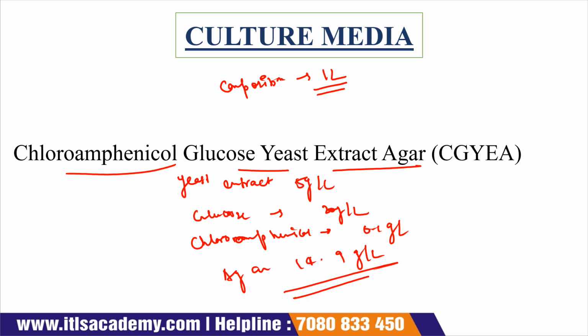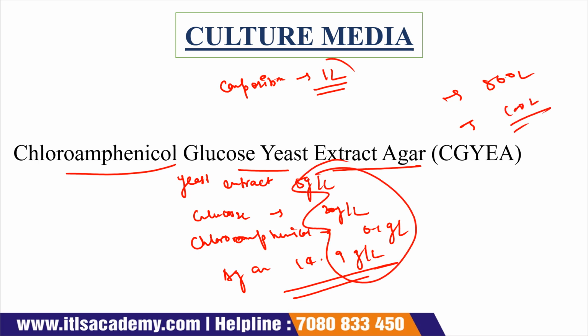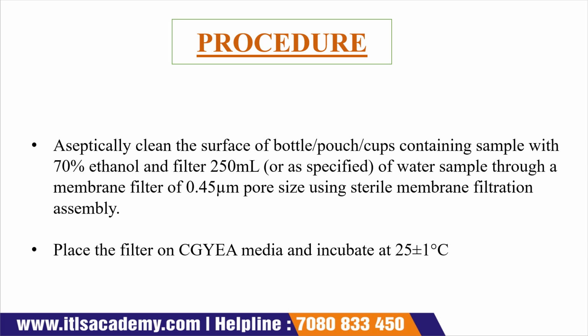If you want to prepare 500 liters or 100 liters, you have to change this composition according to the amount of the distilled water. So this is about the culture media. Now the next is your procedure.